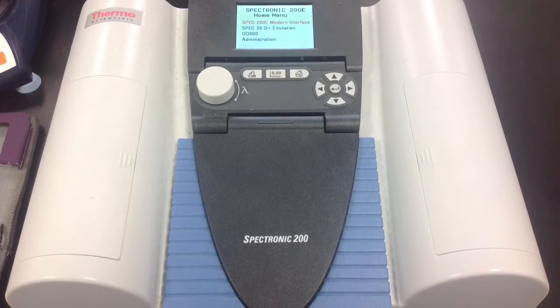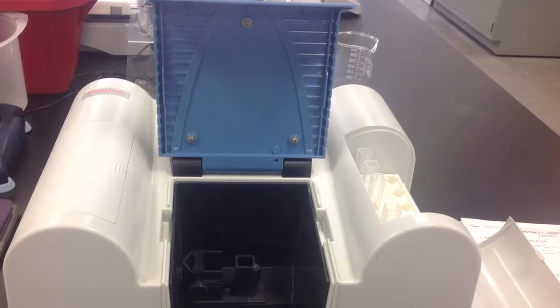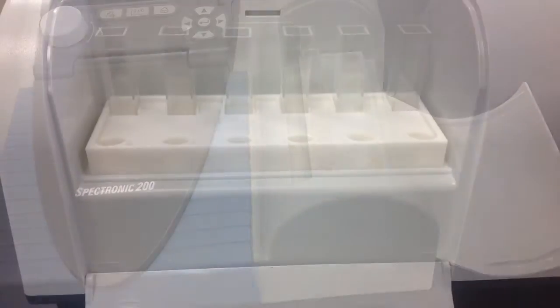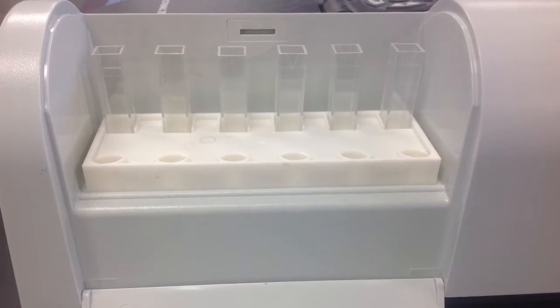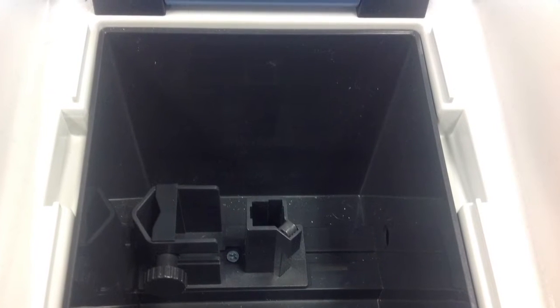Its components include a light source for generating beams of light of specific wavelengths from that source, special holding devices known as cuvettes containing samples through which light beams are passed, and detectors that can measure the intensity of light that has passed through a sample.